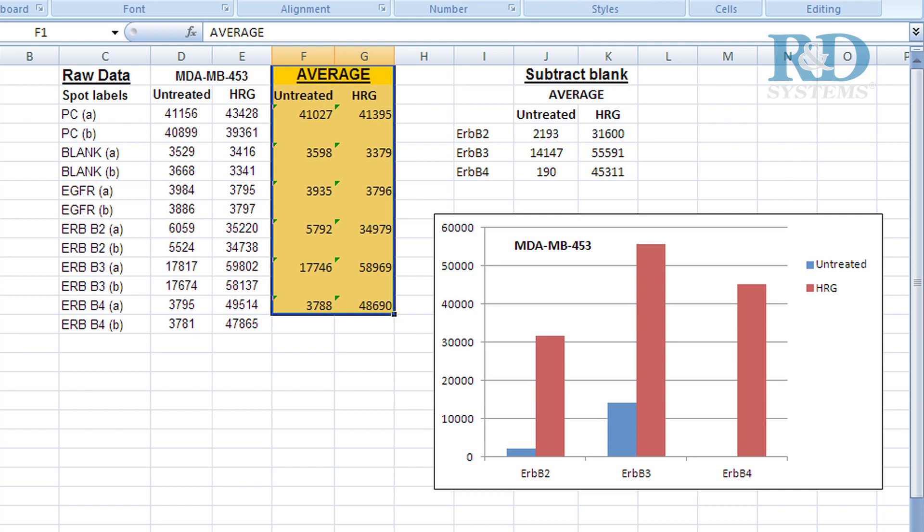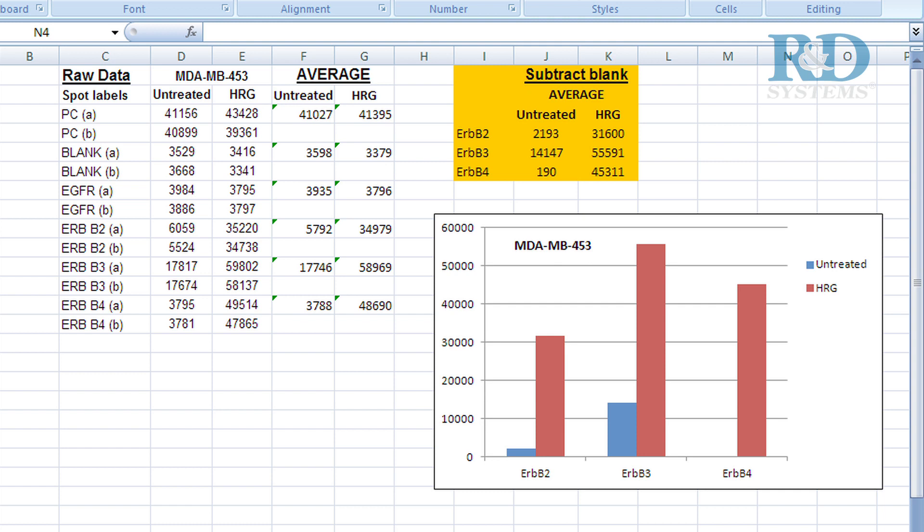Determine the average signal or pixel density of the pair of duplicate spots representing each receptor tyrosine kinase. Using a signal from a clear area of the array or negative control spots as a background value, subtract an averaged background signal from each spot.